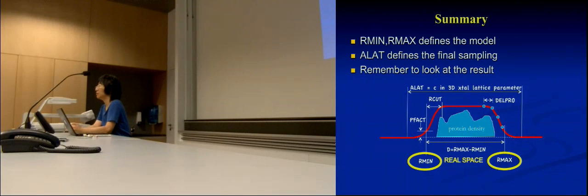Quick question. You talked about the bin size. If I got it correctly, bin size can be defined by A-lot, right? Bin size is determined by the D value. D value. Yeah, because this is all fitting. Okay. Yeah. The A-lot is really only used in sampling. So none of this really applies to the A-lot. It's only the fitting.